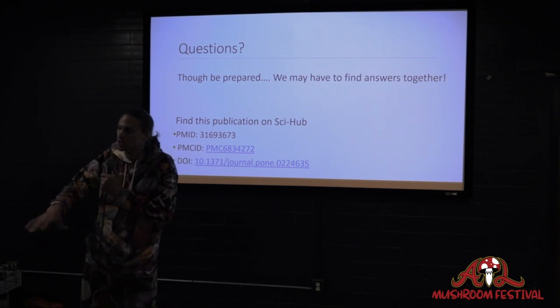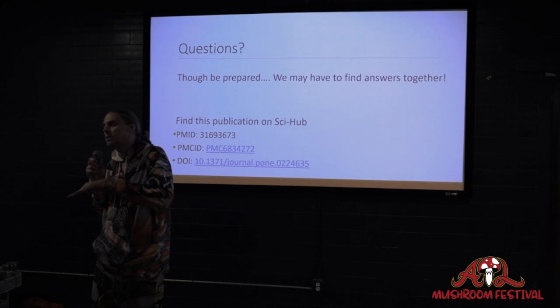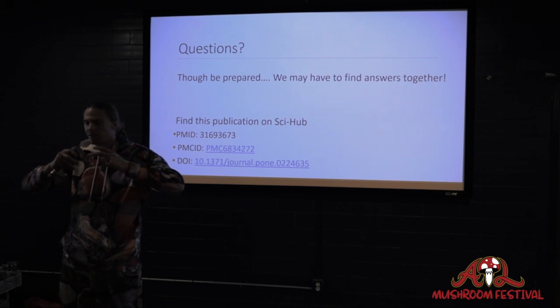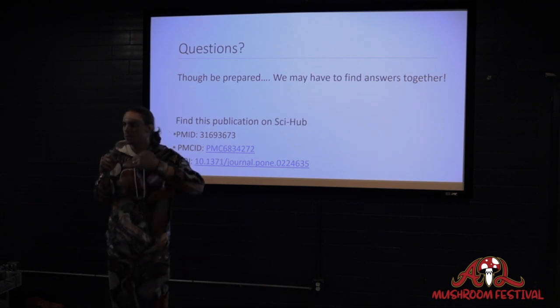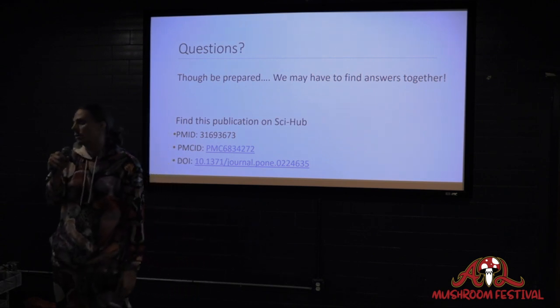It can touch to some degree, and most oftentimes I will have it touching at least one wall. That way it has some contact with something. But generally, it will fluff up, and as it fluffs up, it can start reaching. It has a reach of, let's say, 2 to 3 millimeters, and that is enough reach for it to be able to touch the next surface that's going to be able to provide nutrition so that it can continue growing.